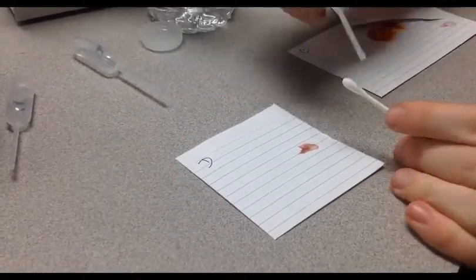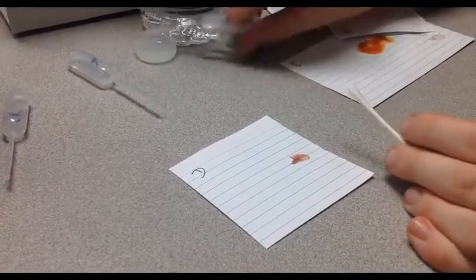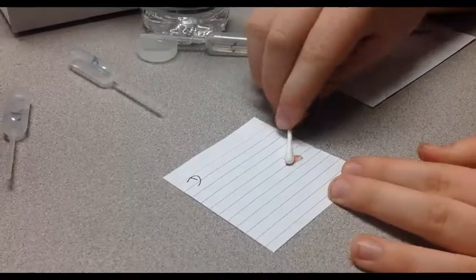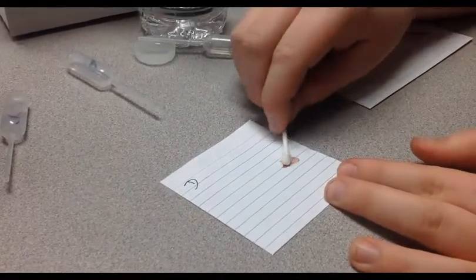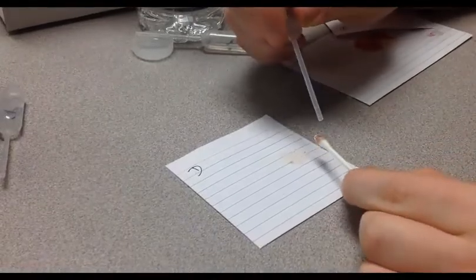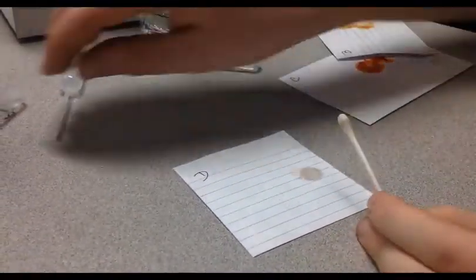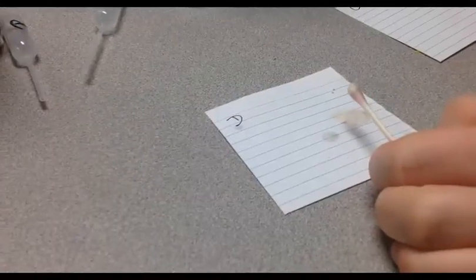We add a little bit of water. We got actual water now. Now we drag it across our sample and make sure we get some. Now we add some alcohol. Okay, now we have our sample with the alcohol, followed by phenolphthalein.